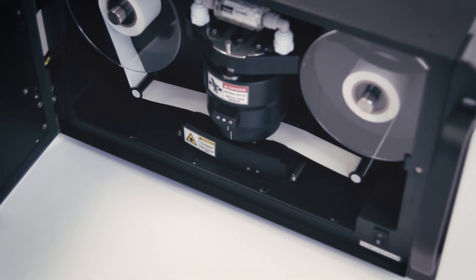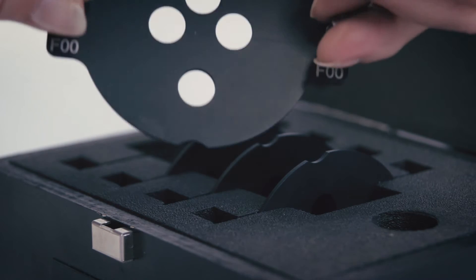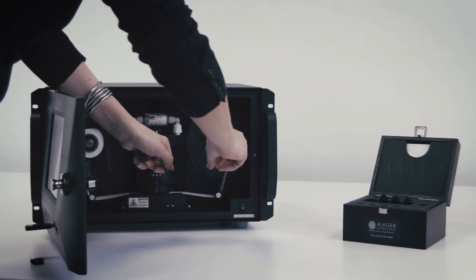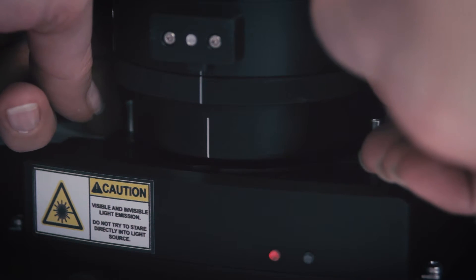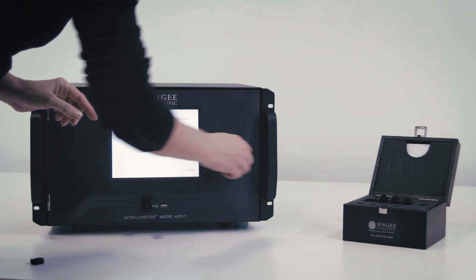When prompted, insert filter disk number 0 on top of the filter tape. Do not touch the glass — hold it by the metal studs. Always keep the filter tape in position across the analytical area. Press OK.